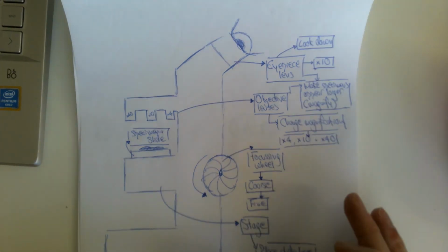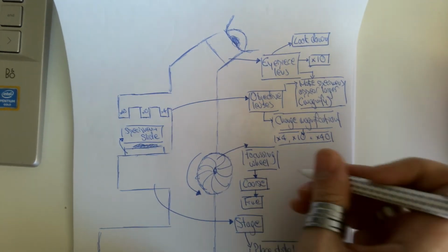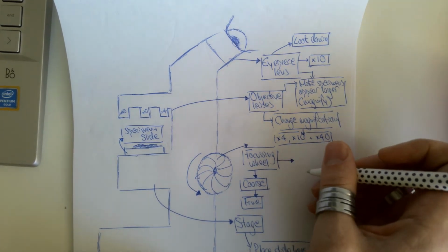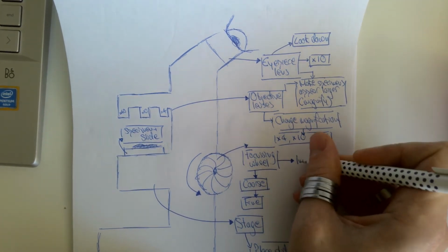Now, their simple job in adjusting those, what you are doing to the image that is shown through the microscope, is you are improving or increasing resolution.